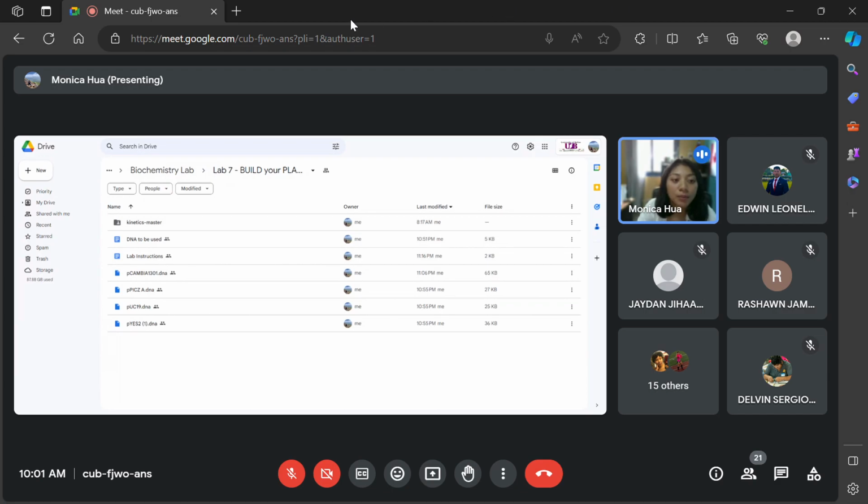To the Benchling link. All right, so just upload all the plasmids for now. And let me see, let me try to upload it too. I don't have it on this computer.